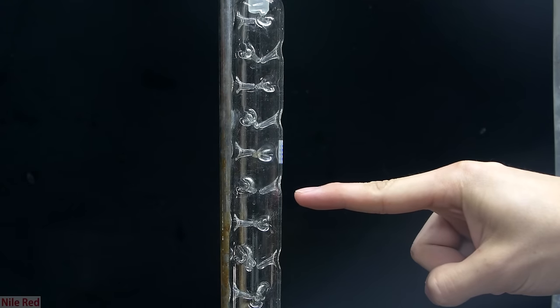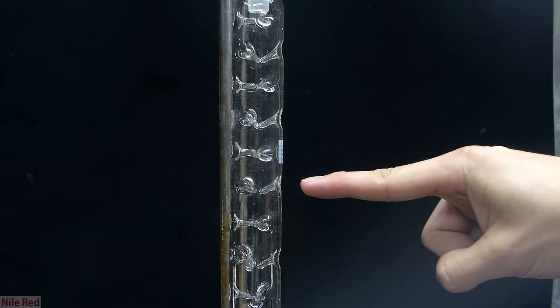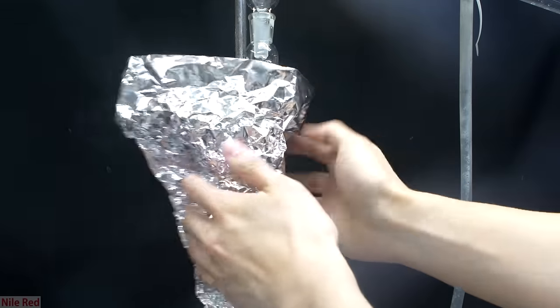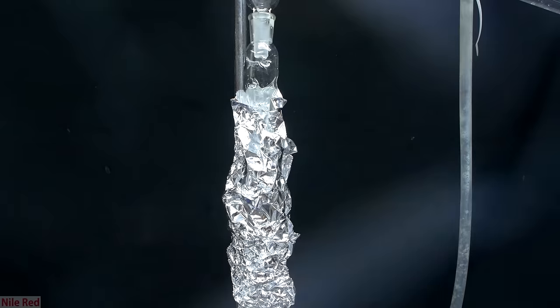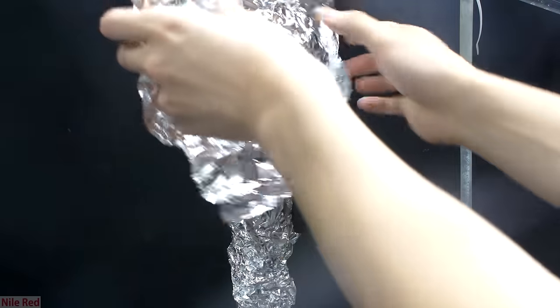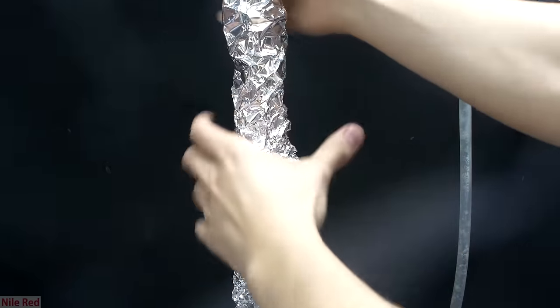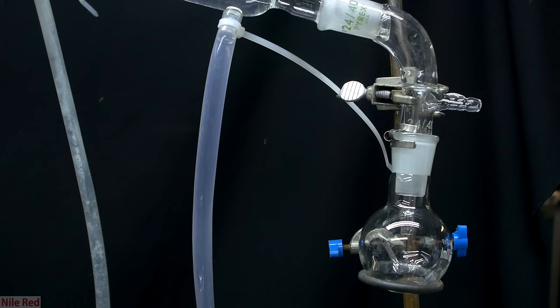As things boil, a vapor front will start to move up the column, and it's a little hard to see here, so I pointed it out using my finger. The next thing that I do is use a little bit of aluminum foil to insulate the fractional column. This is done to make sure that the column stays hot and so that the vapors can make it over to the condenser. When we look here, we can see that vapors have started to make it to the top and some are actually making it over to the condenser.